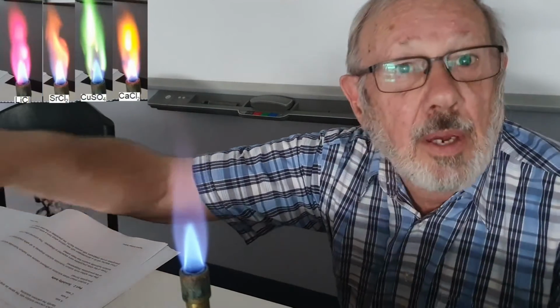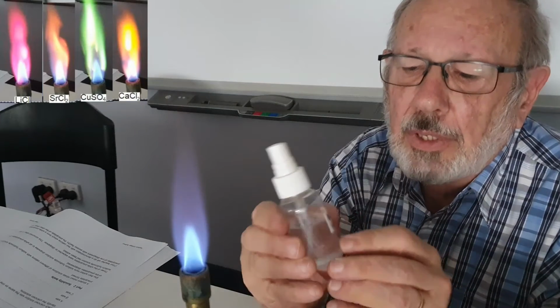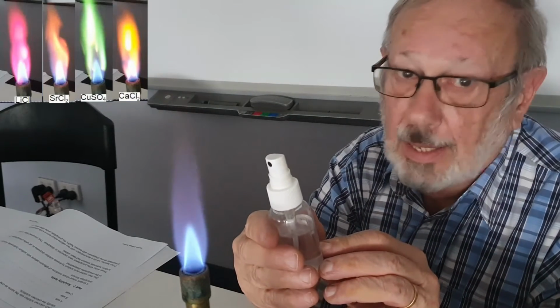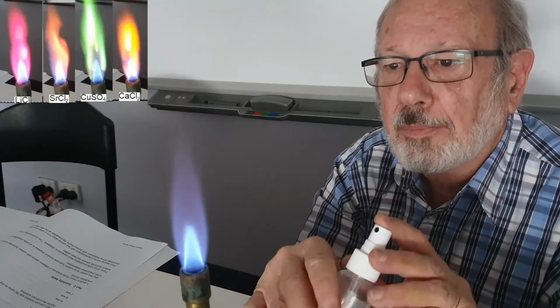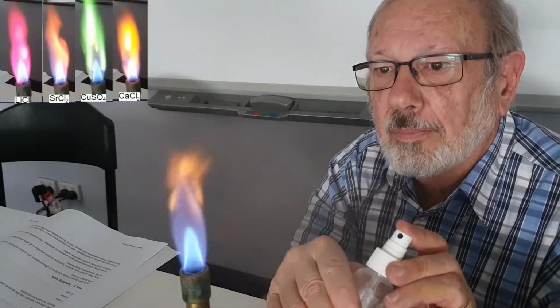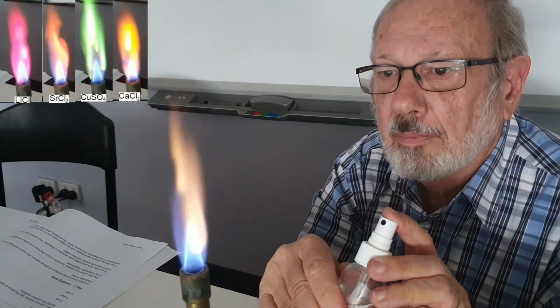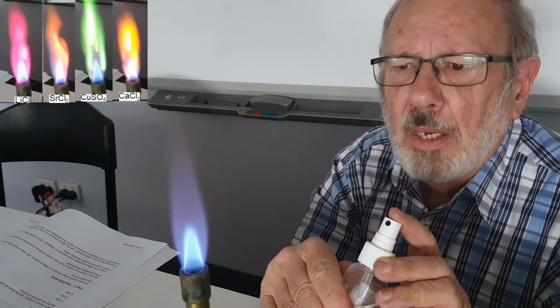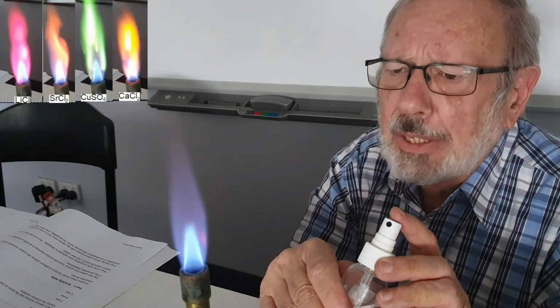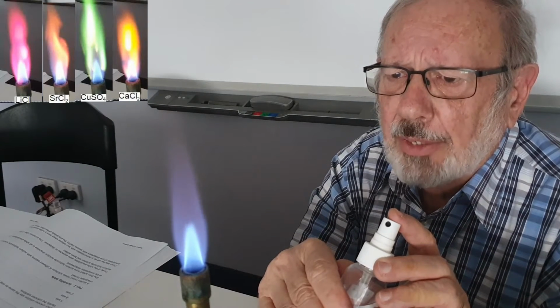So let's try now barium chloride, and barium chloride, as you can see or hope, is BaCl2. So I'm going to call that light green.